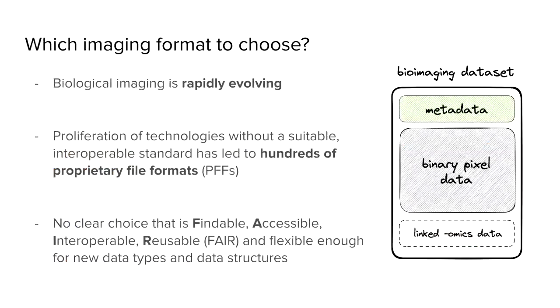So an early question within this process of designing these visualization tools for the data portal was thinking about what imaging format made sense for us to choose, or was an imaging format the right way to think about this problem at all? We quickly went into a deep dive into the biological imaging field, and it is rapidly evolving, and there is a proliferation of technologies without really a clear, suitable, interoperable standard. And so this has led to many, many proprietary file formats.